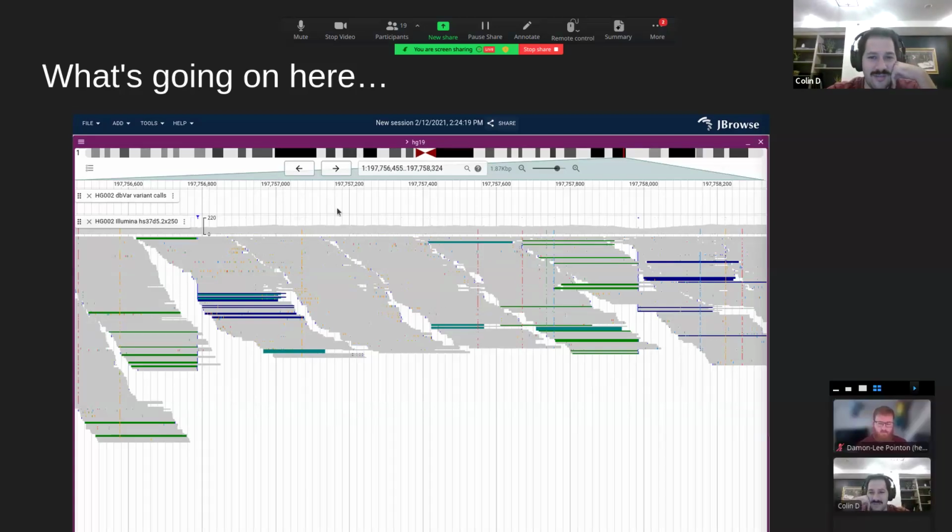And then there's also sort of the coverage track. And one thing that I actually like about JBrowse is that we count how many reads have things like soft clipping at a particular position. So you can get that sense from these little tiny indicators here, and you can be like, well, maybe there's something going on right there. And people who use IGV, I think, are wizards in that they can just intuit from this weird pattern.